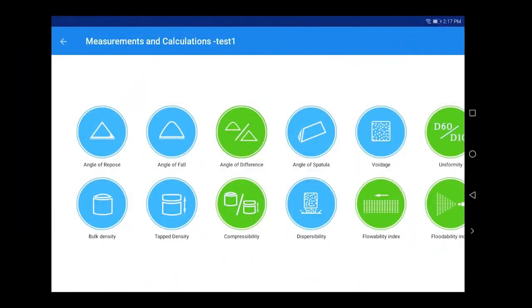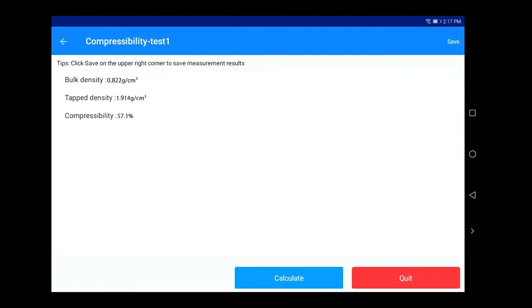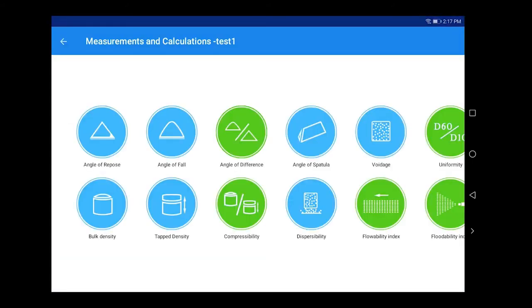After the bulk density and tap density are measured and saved, click the Compressibility. Click the Calculate to calculate compressibility. Click Save, and quit to complete the calculation of compressibility.